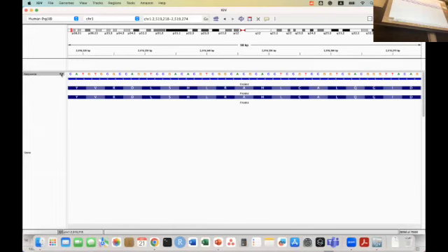So now the first base that you have to read is, you are tempted to read from here, 5' to 3' direction, but no, you shouldn't. You should read from 3' to 5' direction. And do you see that GCA codon, which actually matches here? Yeah, I actually chose a very complicated example so that you can familiarize yourself with using IGV.